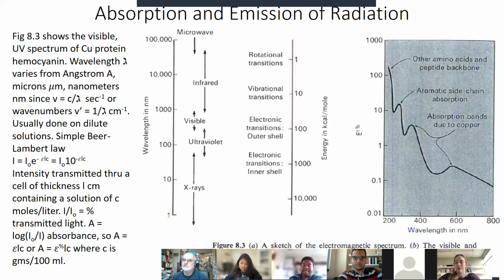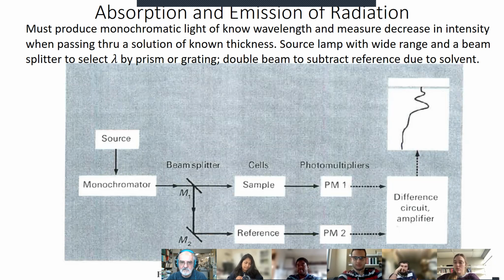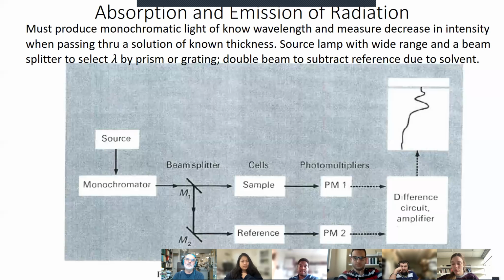Yes, sir, that makes sense. Thank you. Okay. So a typical spectrophotometer, and so that's what this is. It's an outline of a simple spectrophotometer. Most of you have a spectrophotometer in your lab. I know a lot of you use other kinds of devices, or you don't actually use spectroscopy for determining a lot of concentrations.